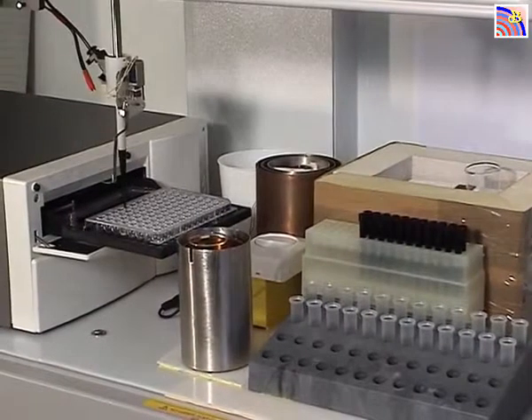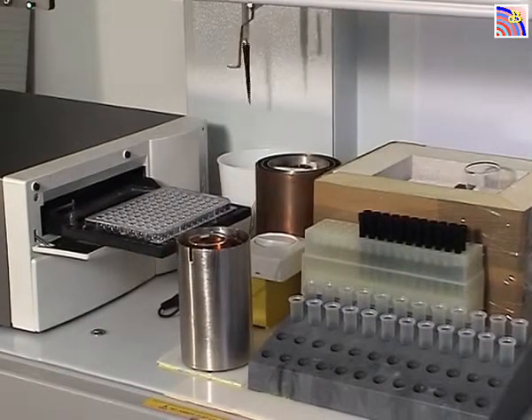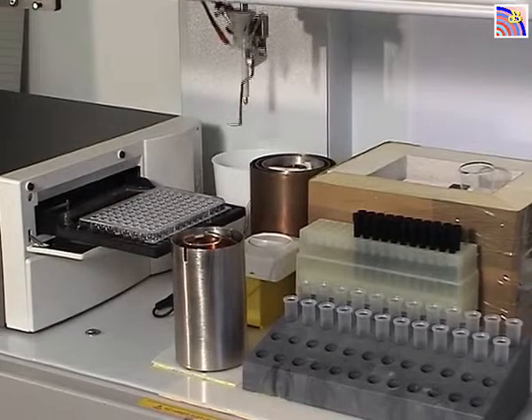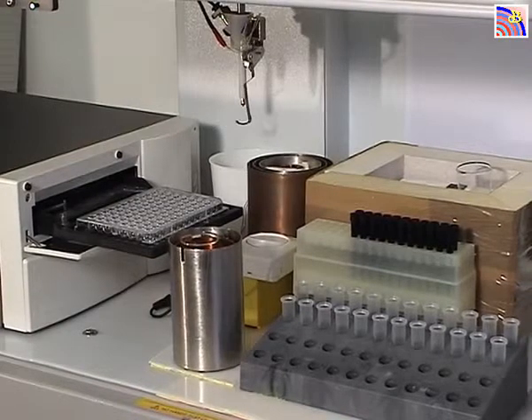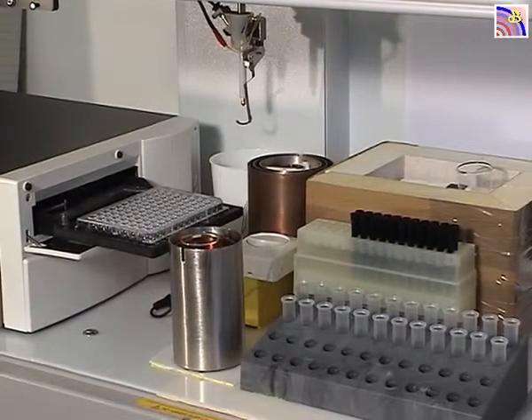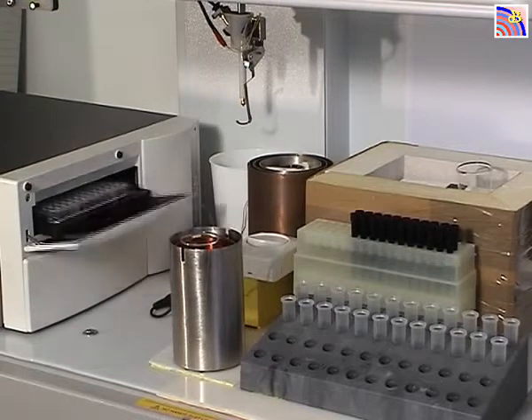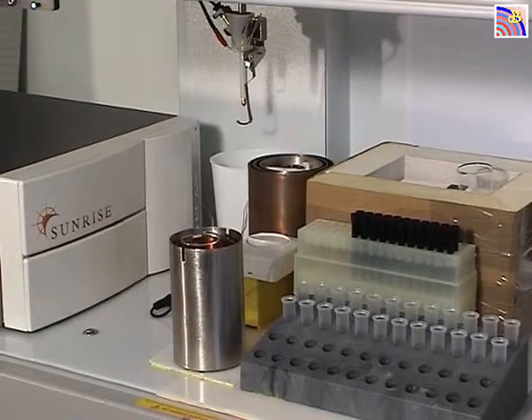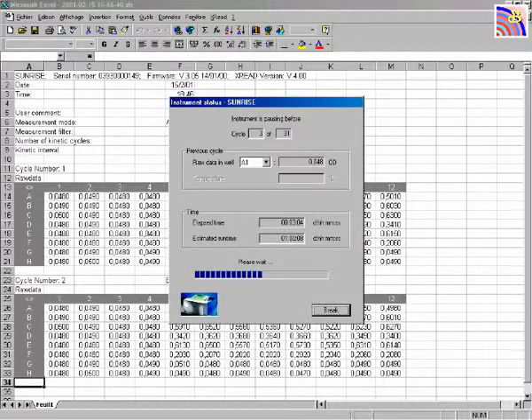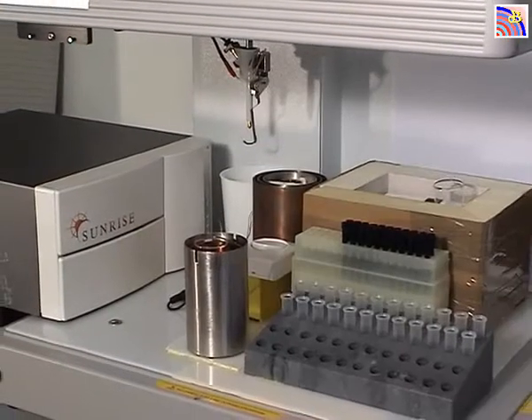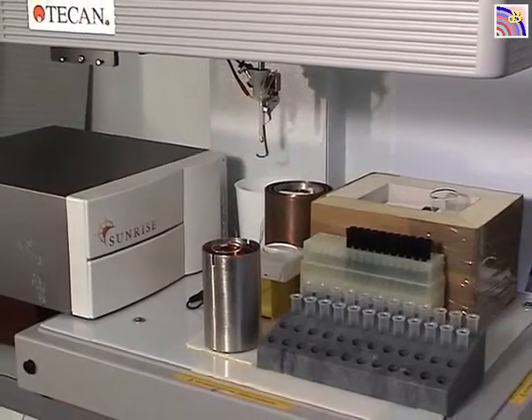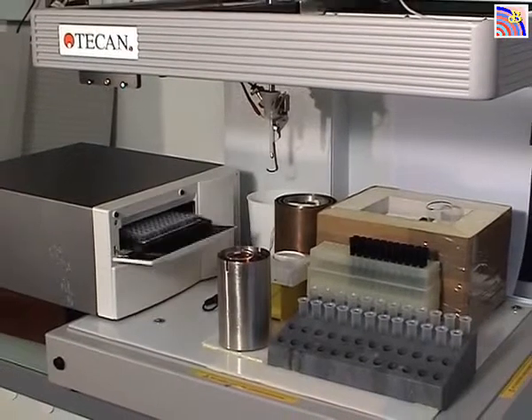Now the eight wells have been filled up with the water-plasma mixture. The plate is going inside the machine and it will be measured every two minutes for one hour. This is what appears on the computer. We are now reaching the end, and the plate will come out after one hour.